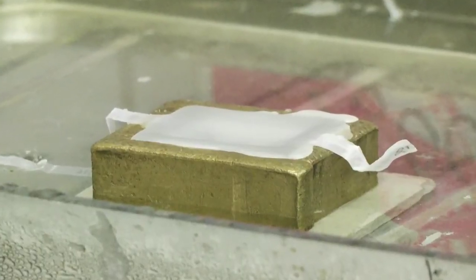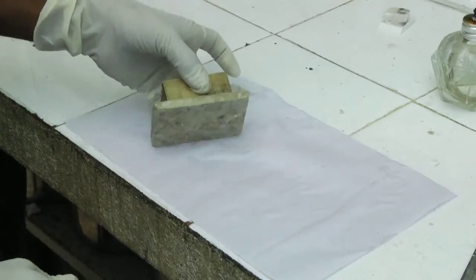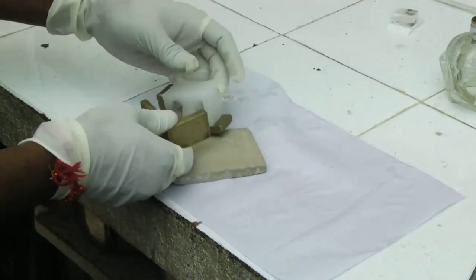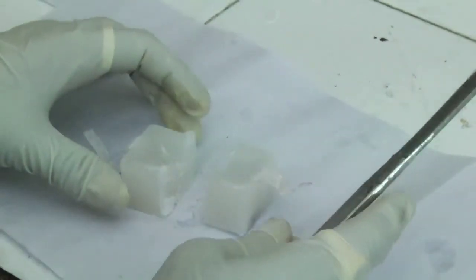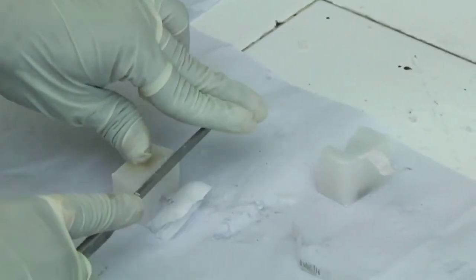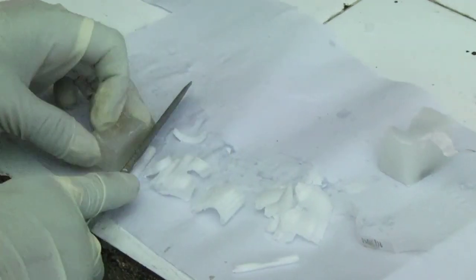The melted paraffin is allowed to harden at room temperature. After hardening, the metallic molds are removed and the blocks are properly trimmed. Then, the blocks are kept in the ice chamber of a refrigerator for some time before cutting the sections.